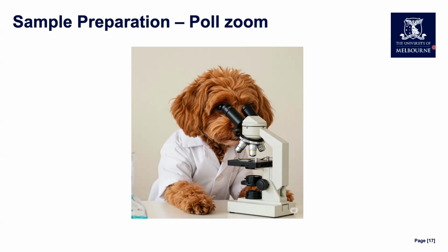Okay, so for question number 1, the question is, what is the best choice of cover glass for most confocal microscope applications? In this case, it is the one that 88% of you selected, which is number 1.5 cover slips or 170 micron thickness, which is good to see.